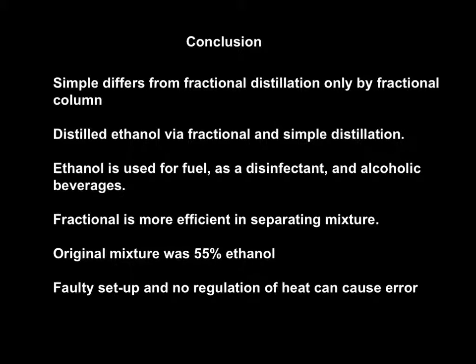As we see, simple and fractional distillation are essentially the same thing. They only differ in the fractionating column, which allows for multiple distillation processes, which ultimately yield a higher concentration or a higher separation of substances. We were successful in distilling ethanol from water through fractional and simple distillation. Ethanol is commonly used in fuel, alcoholic drinks, and disinfectants.